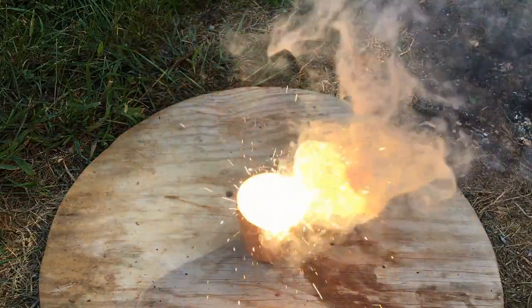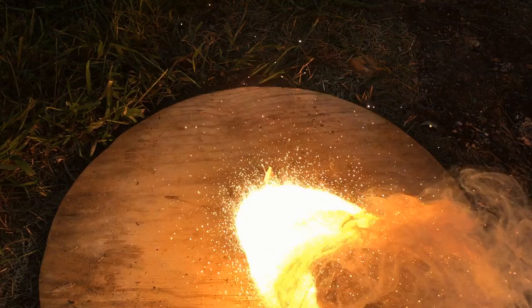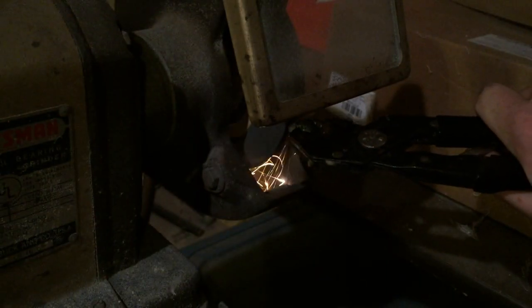Hello everyone, and welcome back to DBX Labs. Today's video is going to be on making thermite from dirt and subsequently making iron from dirt.